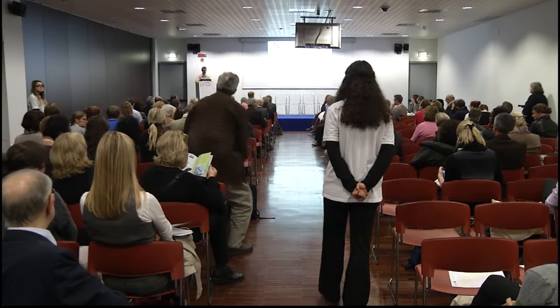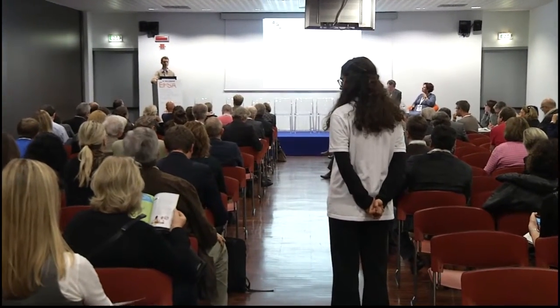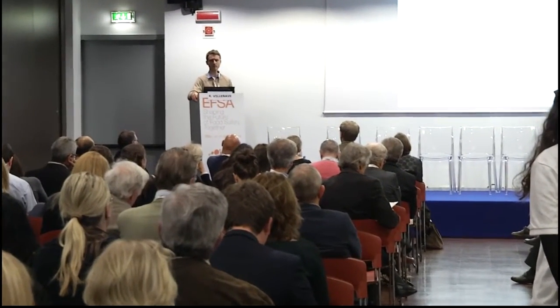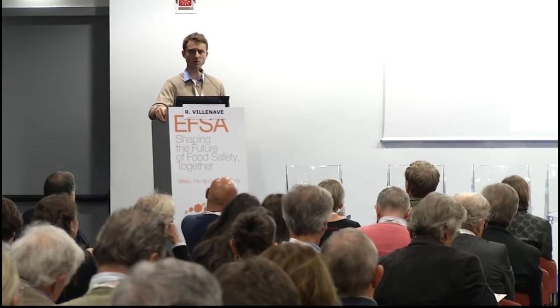Yeah, that's a very, very good question. I was not directly involved in the DARPA project, so I will have difficulty answering. What I can tell you is that it's a very challenging project. We barely started doing some real toxicology and linking organs in a relevant manner, not just linking organs and looking at viability of the cells, but really putting drugs in and seeing how they cross the gut epithelium, for example, and impact the liver viability or growth. So it's really in its infancy, I would say. I don't have a really good answer for this question.